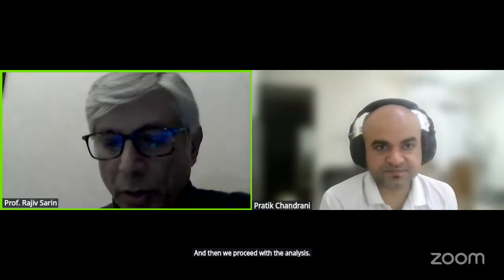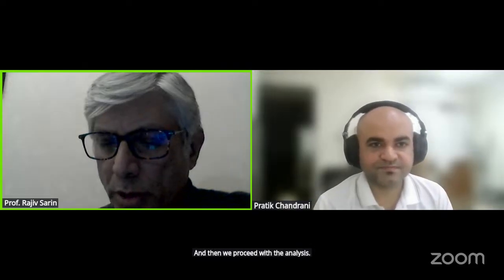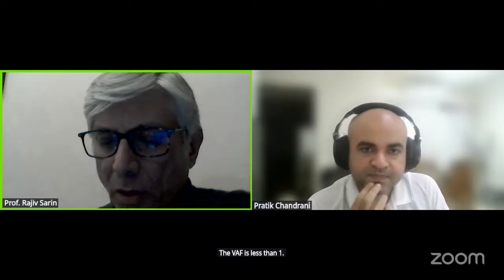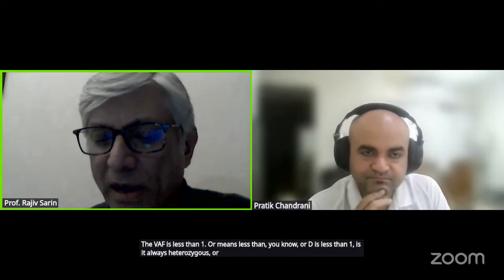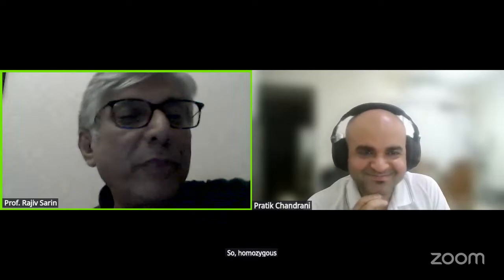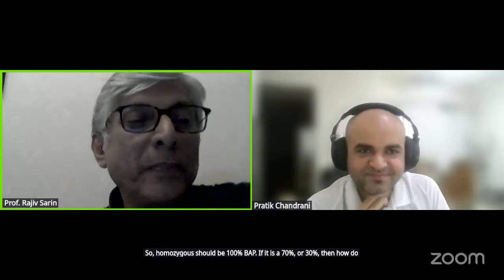Okay. Thank you. Another question from Sriram Chandramurthy Pila. If the VAF is less than one, is it always heterozygous, or is it more complicated to identify heterozygous? Homozygous should be 100% VAF. If it is, say, 70% or 30%, then how do you infer?